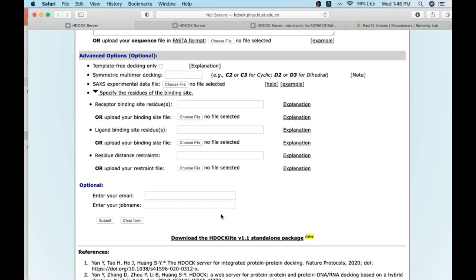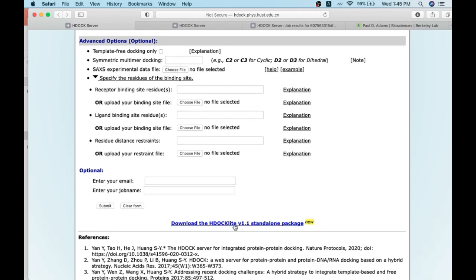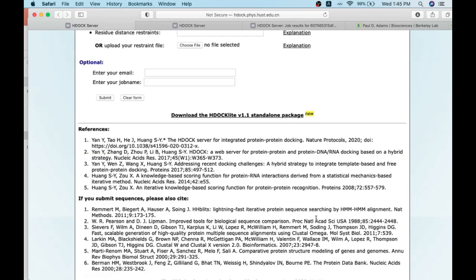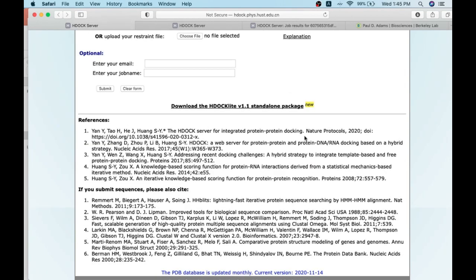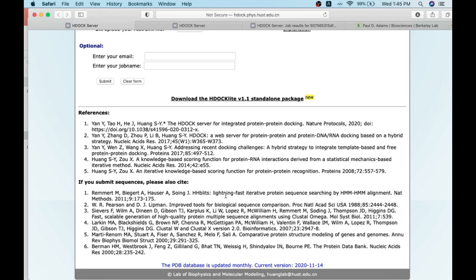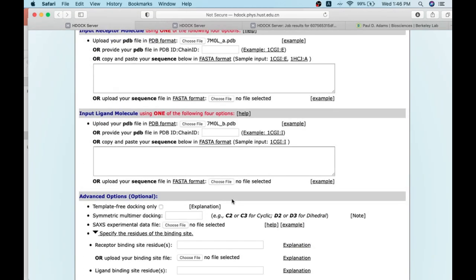Finally, you can give your email and job name so that you will receive a notification with the result link once the job is completed. Here is the link where you can download the standalone package. Remember that when you use any bioinformatics tools or servers, you must cite them properly — these are the literature references provided, and we need to cite their publications whenever we use their servers and tools in publications.